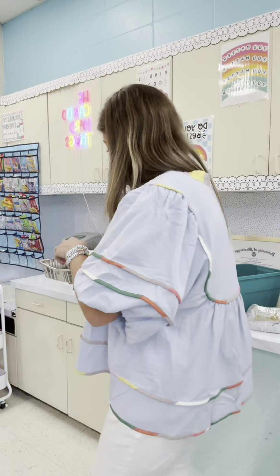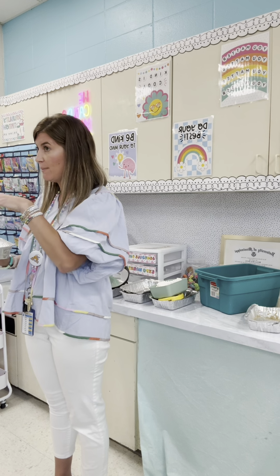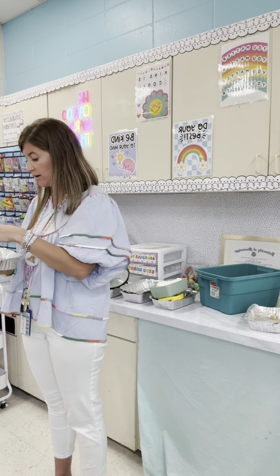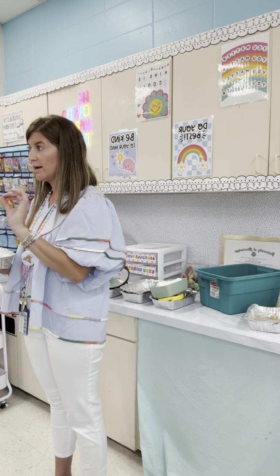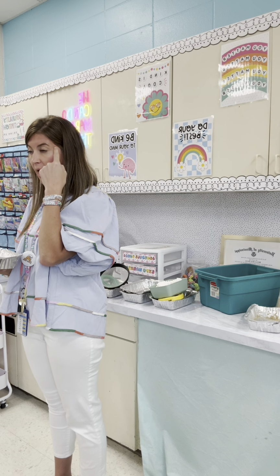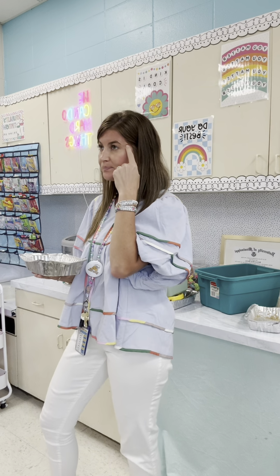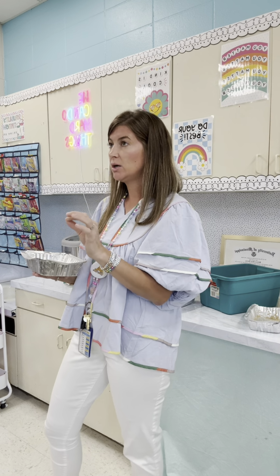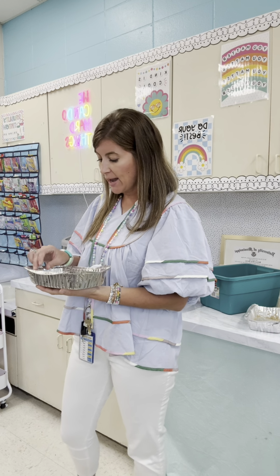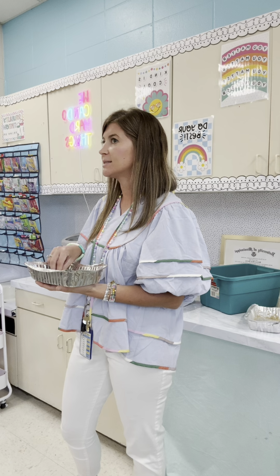All right, so we're gonna do a separating mixtures lab. In my container, I have sand, rocks, and iron filings. Do not shout out. I want you to think, is this mixture a heterogeneous mixture or a homogeneous mixture? Think. Don't say it out loud. Just think. Okay? I want you to put one finger in the air if you think it's heterogeneous, 2 fingers in the air if you think it's homogeneous.